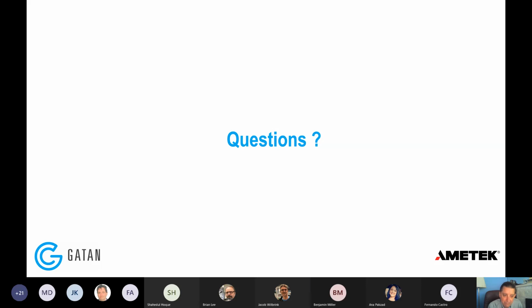Ben? Yeah, thanks. There was only one question that's come into the chat so far, and I answered it via chat, about whether that radial summation of the diffraction pattern is built into GMS, which it's not at the moment, but I can send the script.